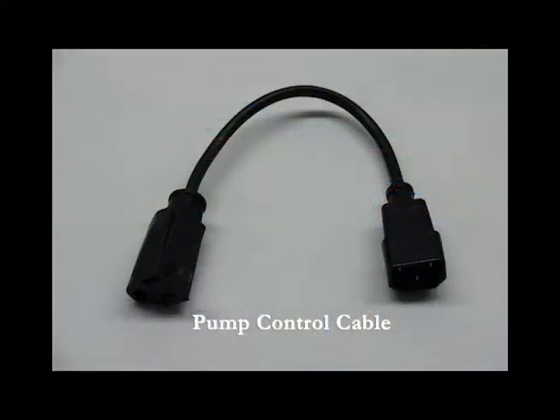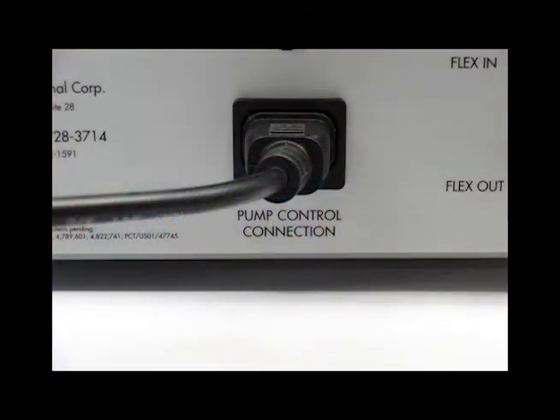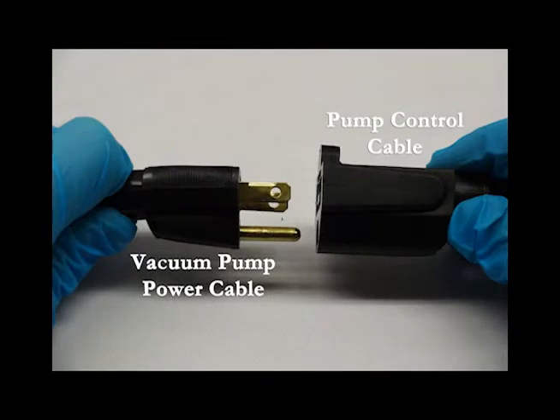To connect the supplied pump control cable, connect the male end to the pump control connection outlet on the back of the flex link controller. The opposite end of the cable connects to the vacuum pump power cable.